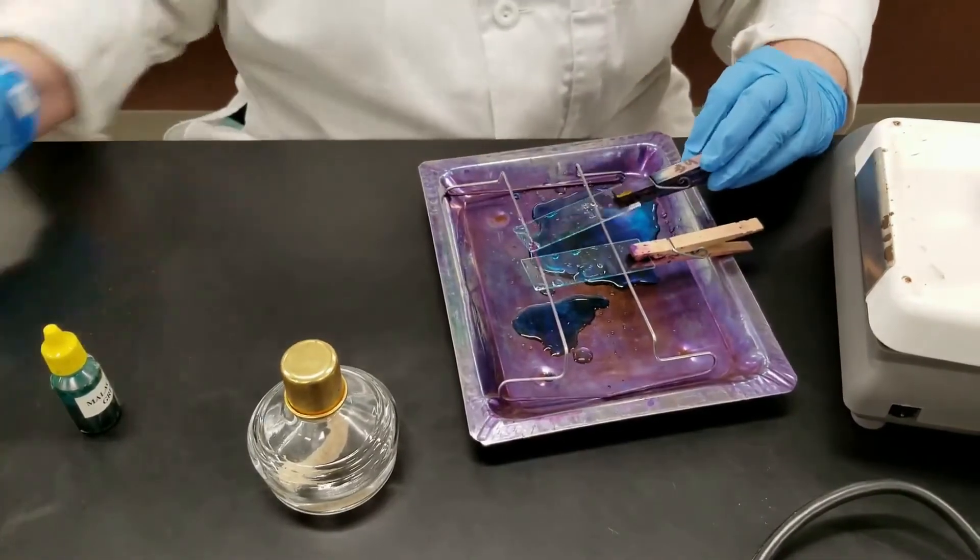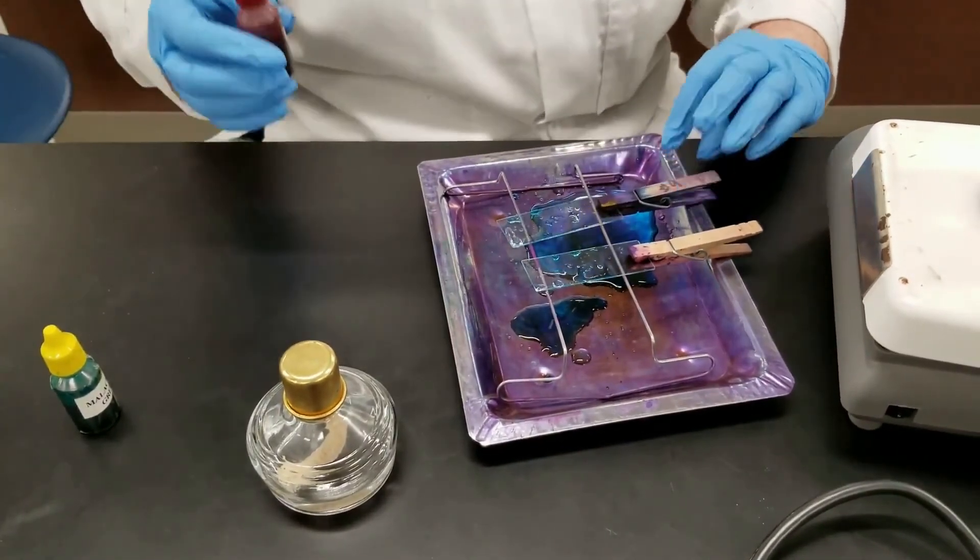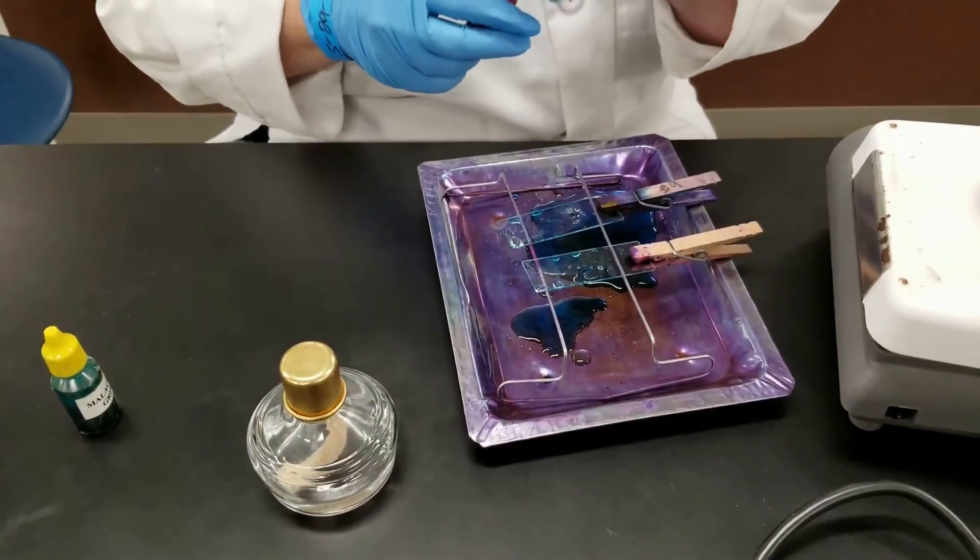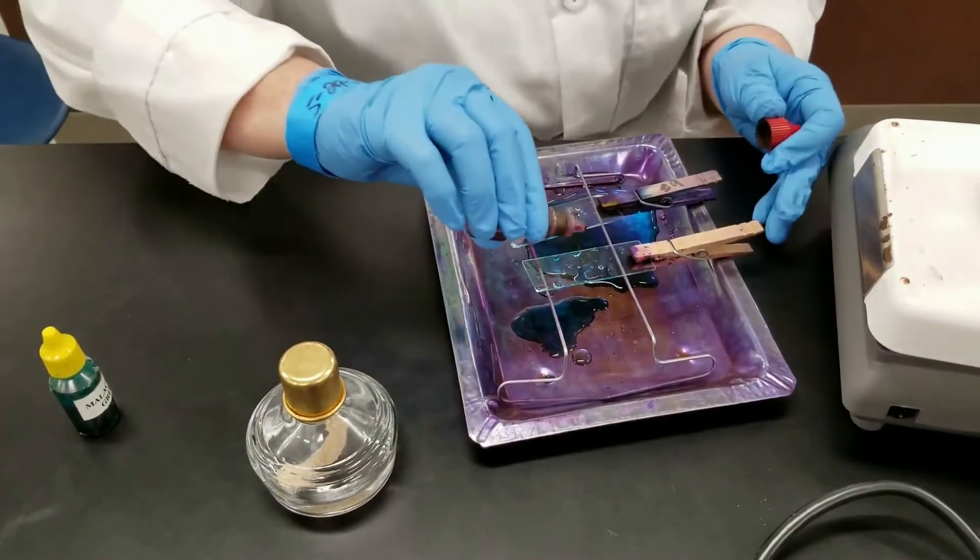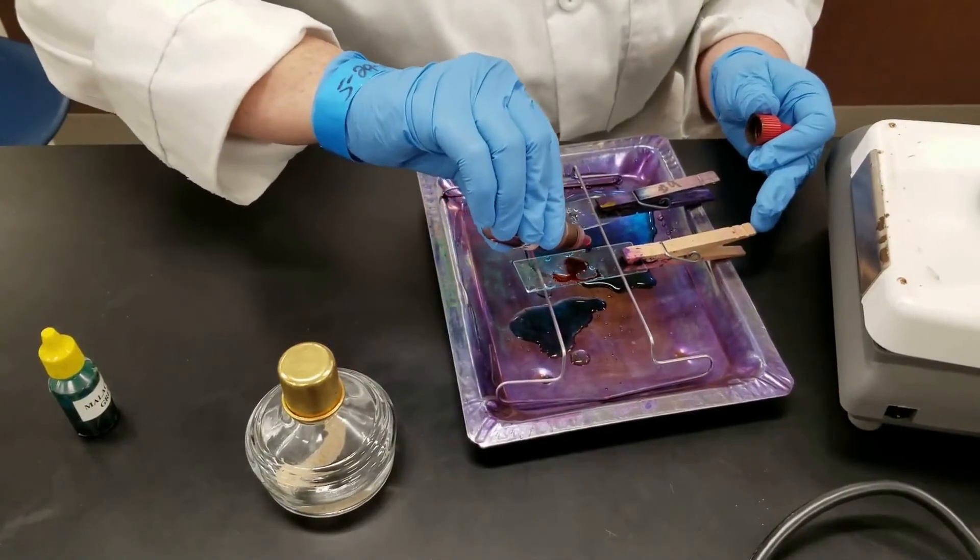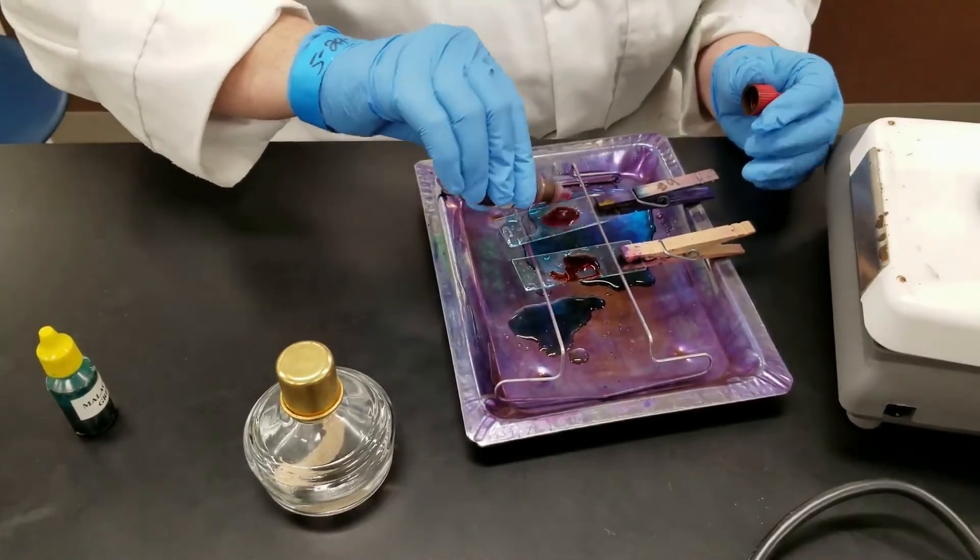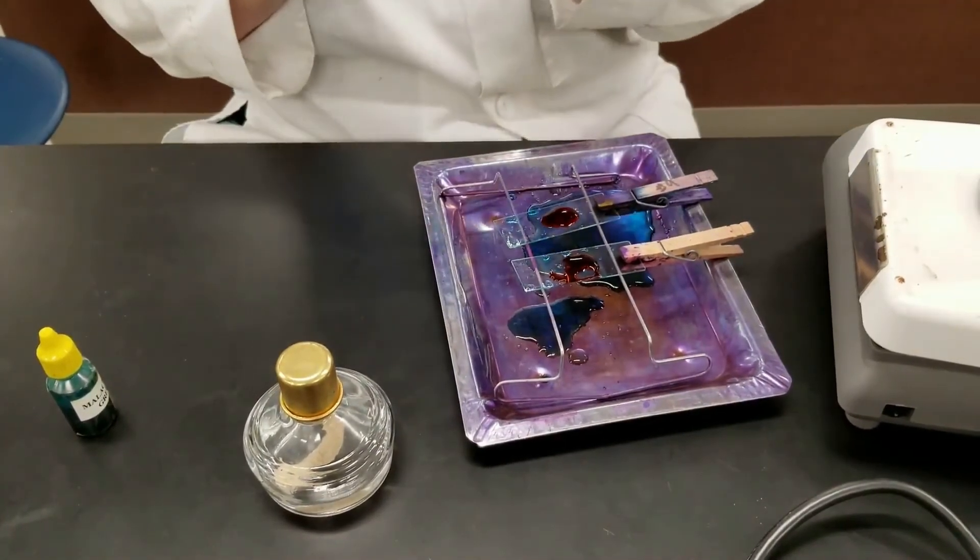Now we're going to add the counter stain, which is safranin red. We're going to put this on. It will stay on for one minute. Here comes the safranin red, and we'll let that sit now for one minute.